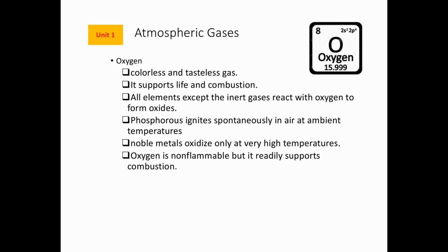OSHA, just for your information, defines the range of 19.5 to 23.5% oxygen as best suited for humans. I don't know what your oxygen deficiency monitor is set at, but if it's below 19.5%, it should give you a warning. All elements except the inert gases react with oxygen to form oxides.